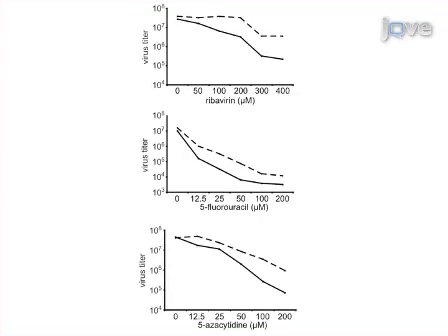To confirm broad resistance to RNA mutagens of different structure, the high-fidelity A372V variant of Coxsackie virus B3 that was initially isolated in the screen was tested for reduced sensitivity to different concentrations of the RNA mutagens ribavirin, 5-fluorouracil, and 5-azacytidine.